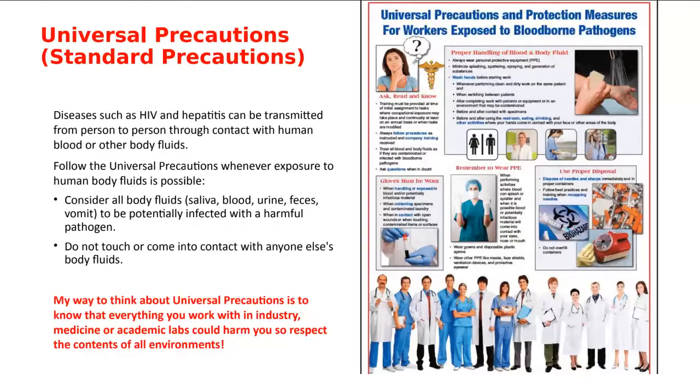If somebody cuts themselves in the lab, then that is a potential for a bloodborne pathogen. So I will be dealing with that. Okay, if you want to know how to clean that up, if that happens in the lab, you guys can watch, but you guys are not to clean up any type of vomitus or blood that might happen in the lab. I will take care of that. Okay?